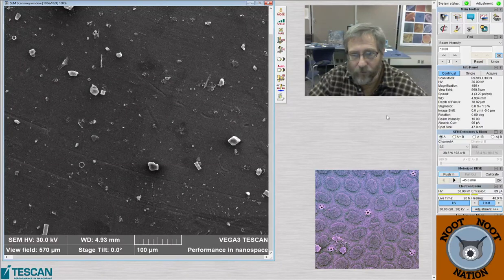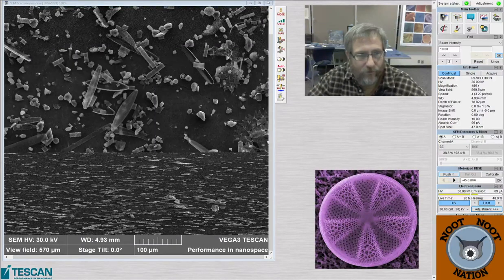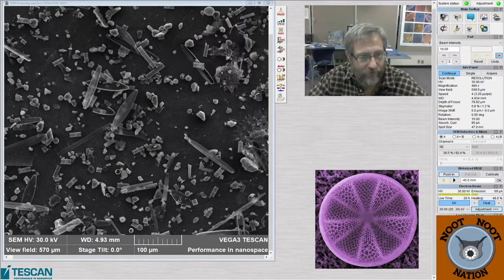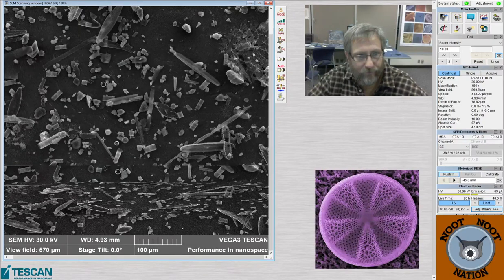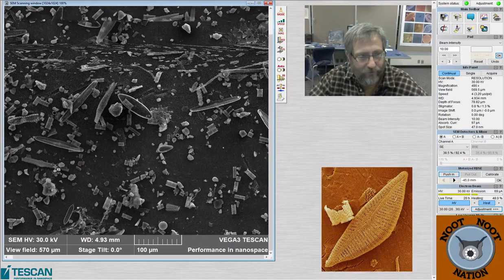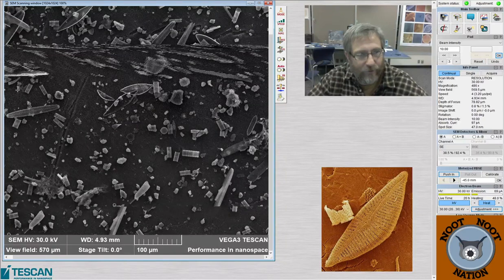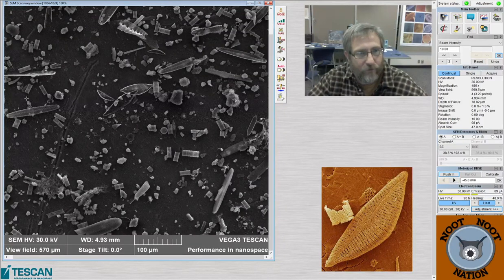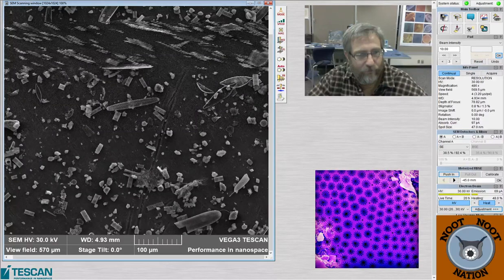I'm going to first jump back to the middle. The first sample, the one that's right in the middle here, which is 7 for us. And we'll come back and look at this sample when I'm done sort of chatting about it, but I wanted to get one good image collecting, and I can set it up to do like a 10-minute photo. And then I can sort of yak while it's taking the photo.